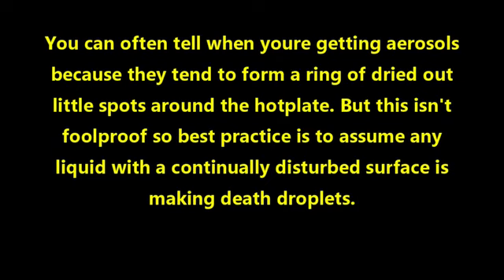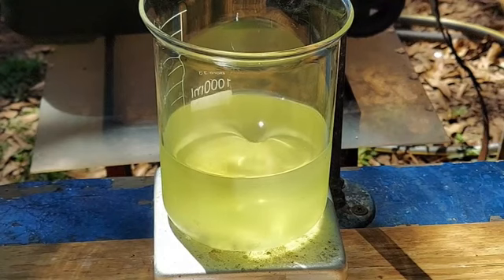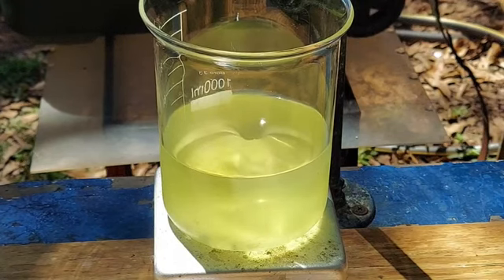Aerosols, of course, will be carried by whatever air currents happen to be around and will settle on whatever surface they happen to come across, thus contaminating every goddamn thing they touch. And droplets of water, in other words, droplets of the solution, can be very, very small indeed. They can be too small for you to see. And so aerosols, right up there with ultrafine dust, are a source of concern, or at least they should be if you have any measure of sanity whatsoever.